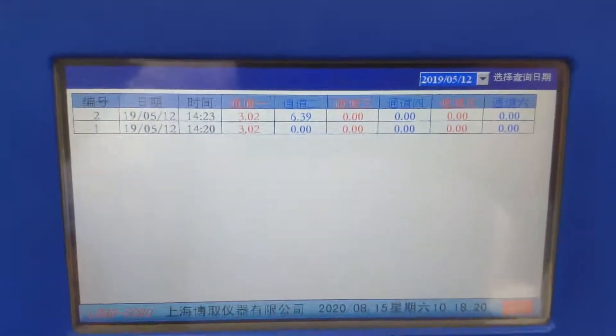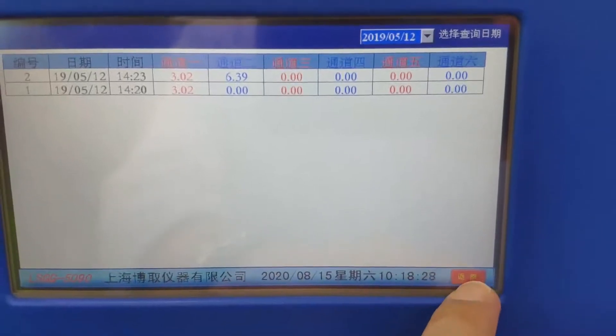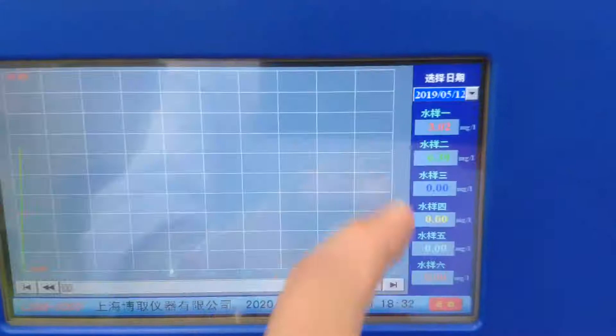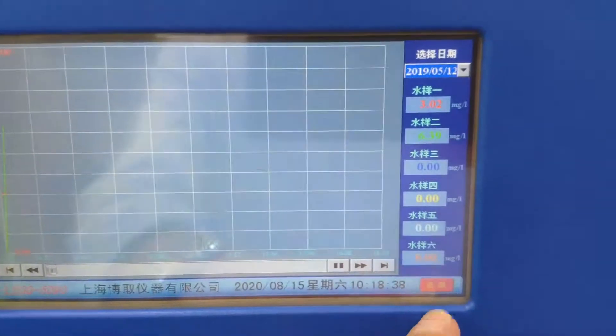The six-channel configuration is available for foreign countries with an English menu. It displays history data for channels one through six.